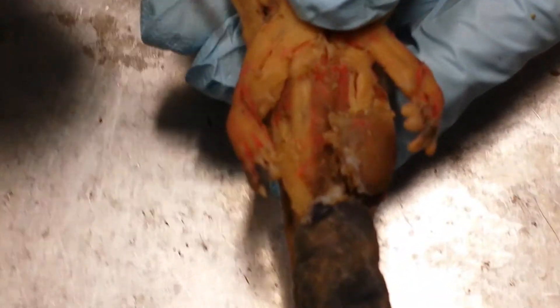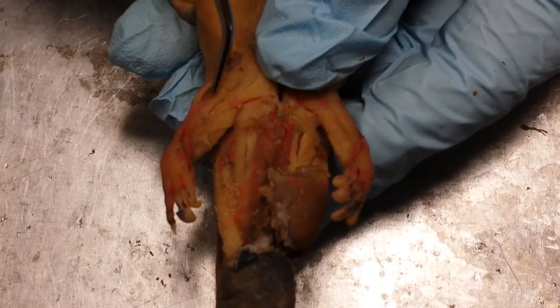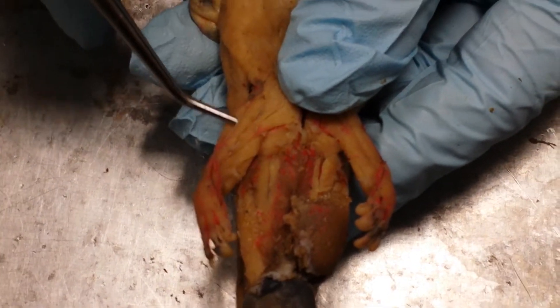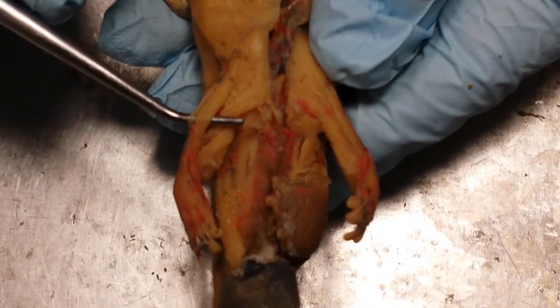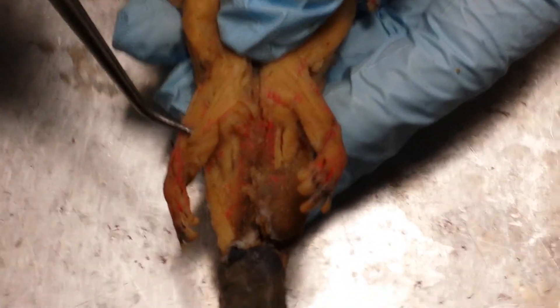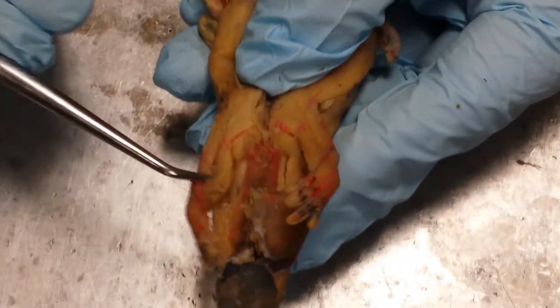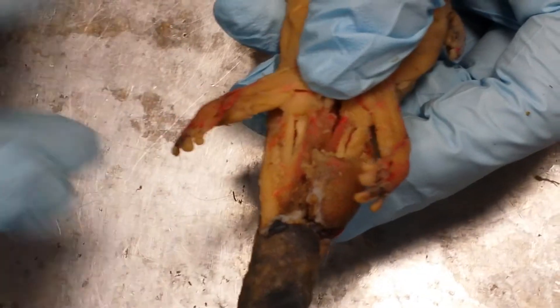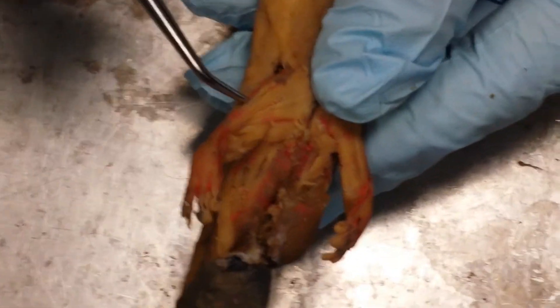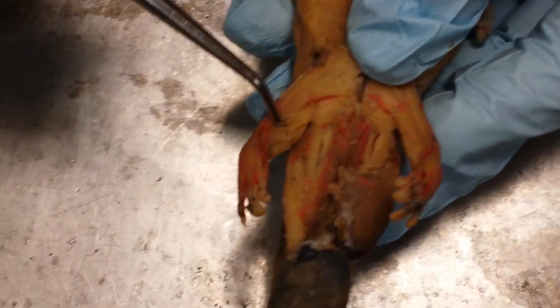On the leg there are four strips of muscle. The very anterior one, like your quadriceps, is called the pubo ischio femoralis internus. Then there's a little strip — this is the pubo tibialis. The third is the pubo ischio tibialis, which runs from the body midline all the way out to the leg. And the most posterior muscle, forming something like the hamstring, is your ischio flexorius.